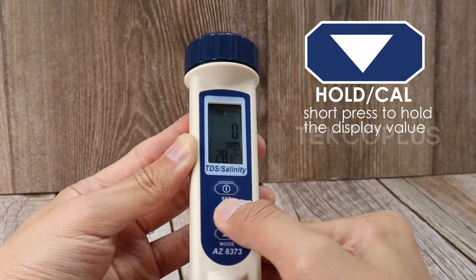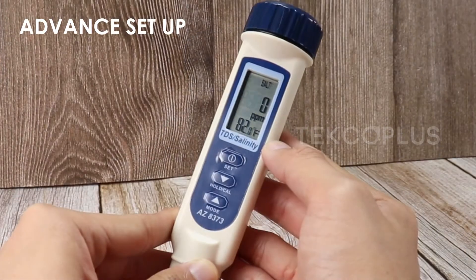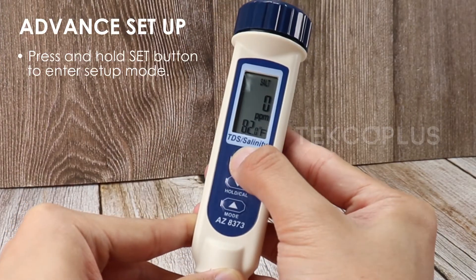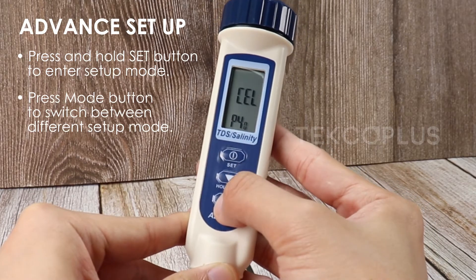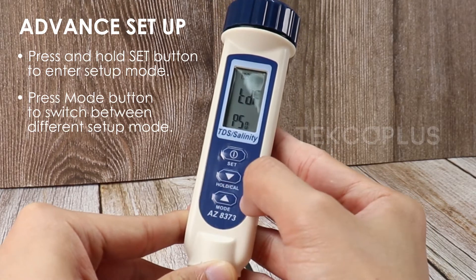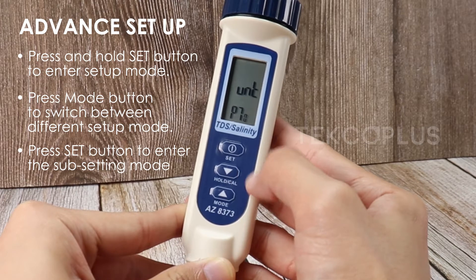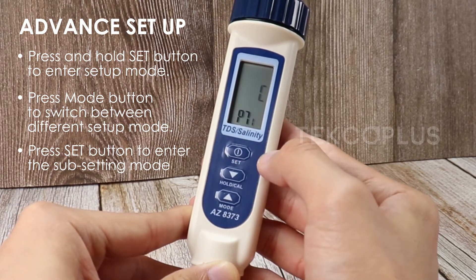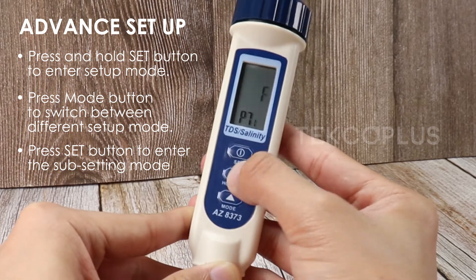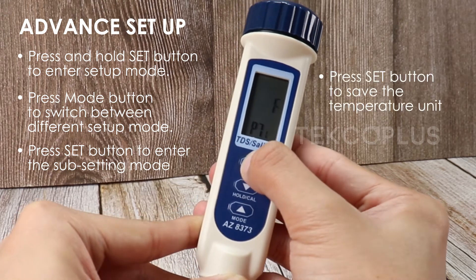Press the hold button to hold the displayed value. To change the temperature unit, press and hold the set button to enter setup mode. Press the mode button to switch between different setup modes. Press the set button to enter the subsetting mode, then press up and down to choose the unit. Press set button to save.